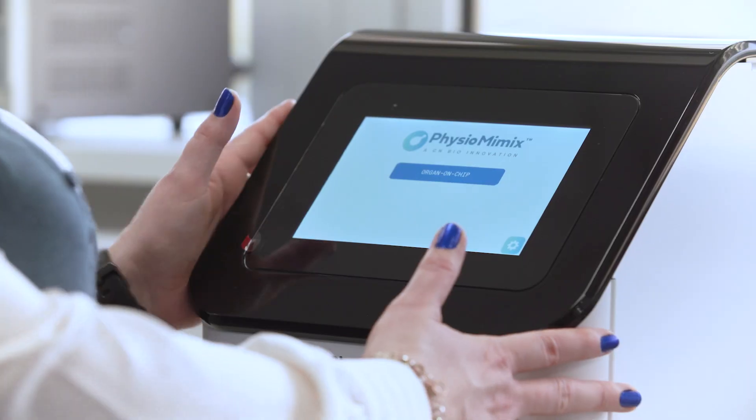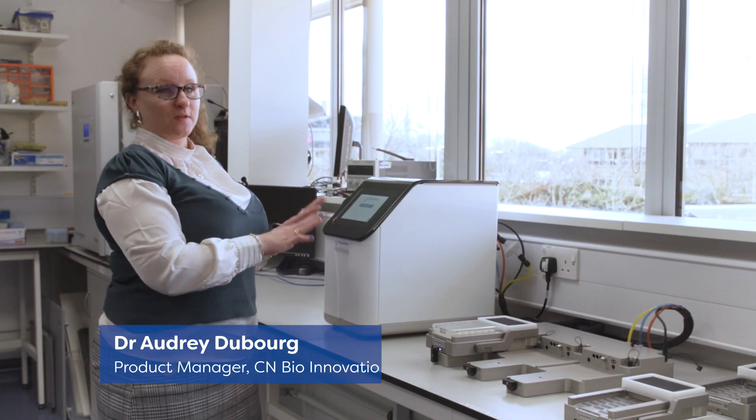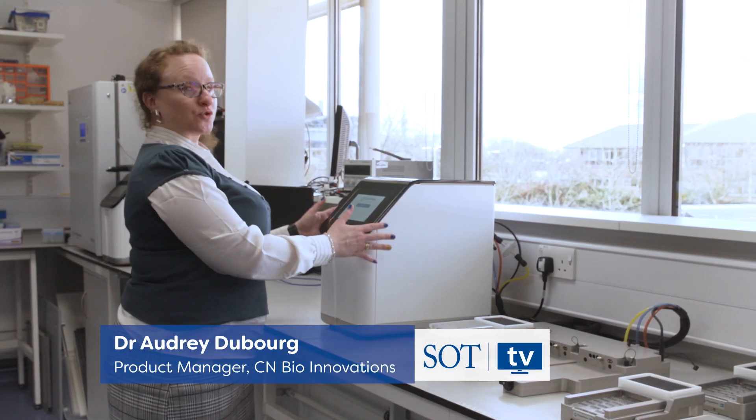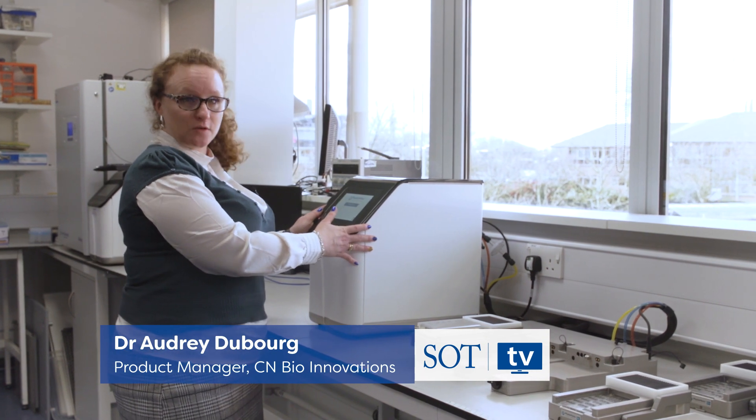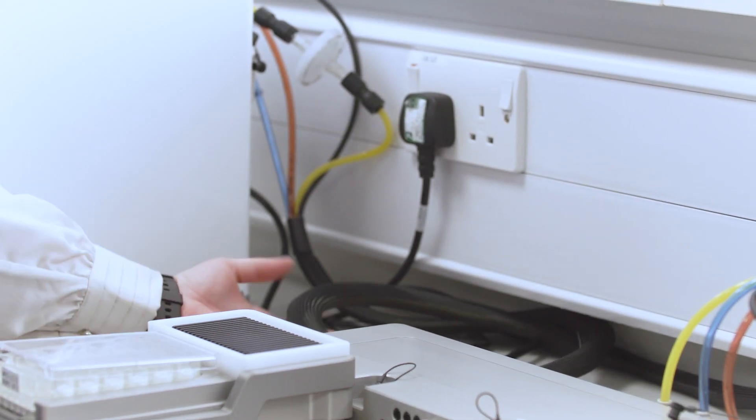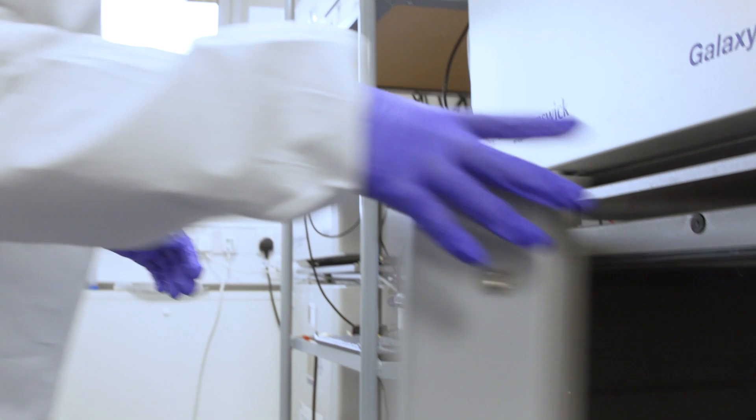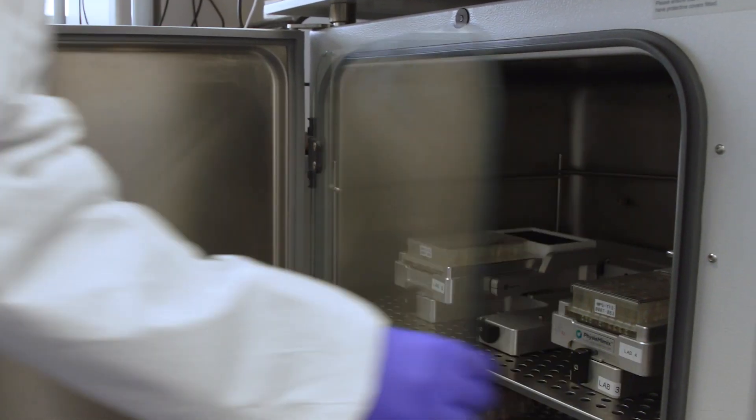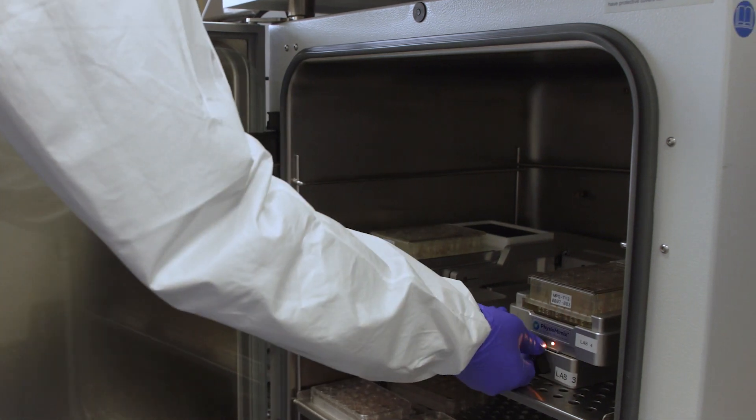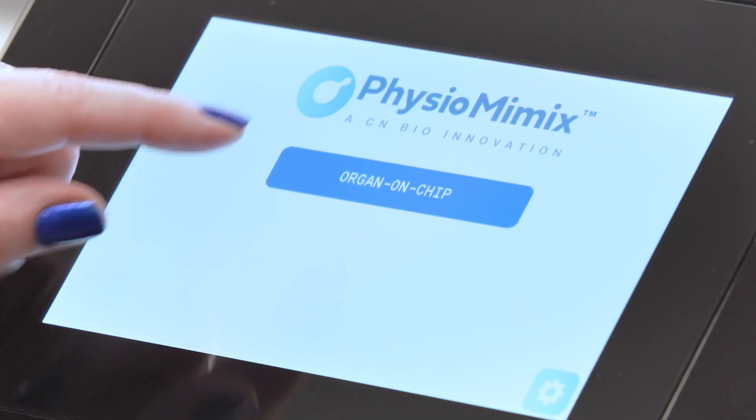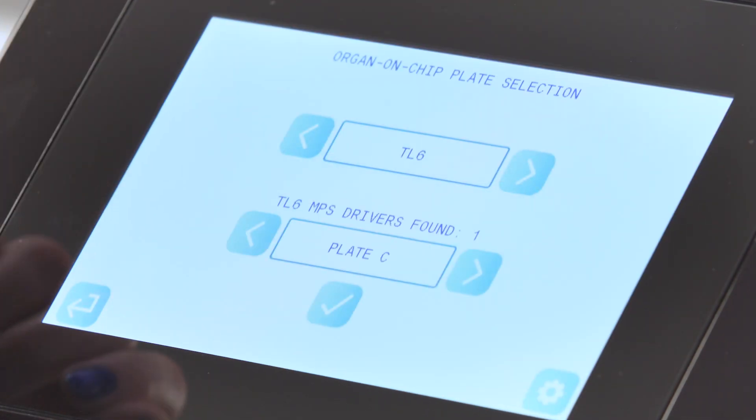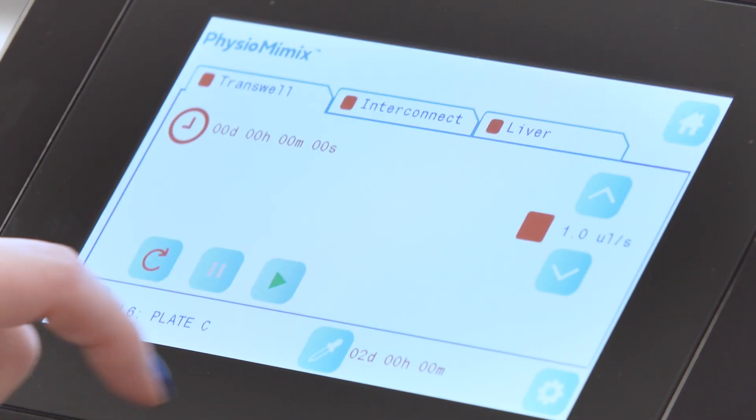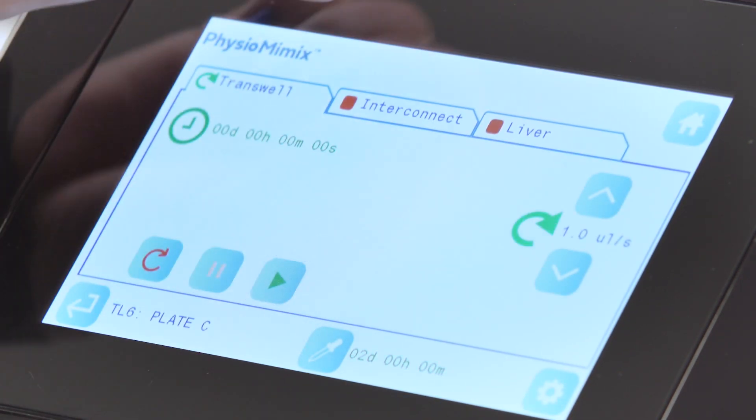This is the Physiomimics organ on chip system. The system is comprised of a controller that sits outside of the incubator which is connected inside of the incubator to a docking station. That docking station can host three drivers on which the plates are connected as well. To set up your experiment just simply select the plate you want and then press play on the program you want.